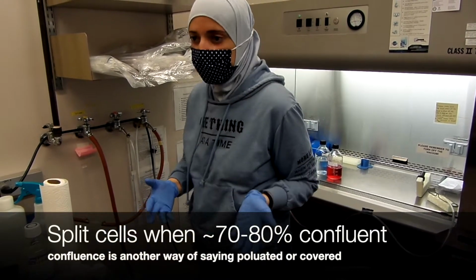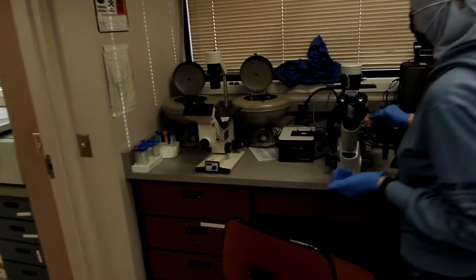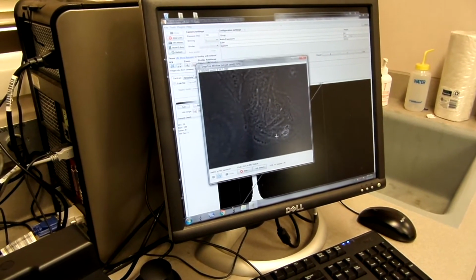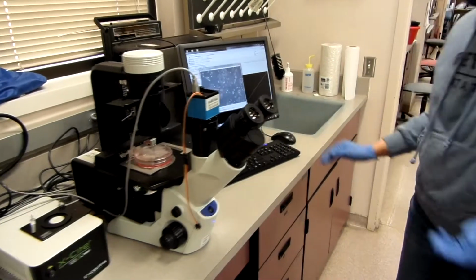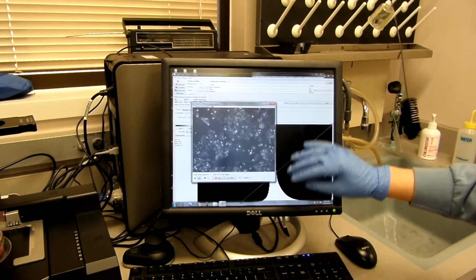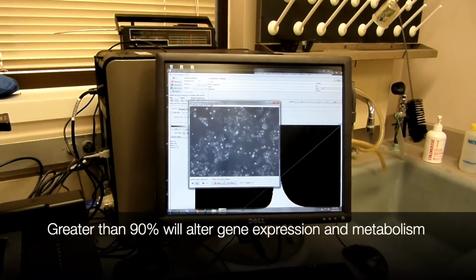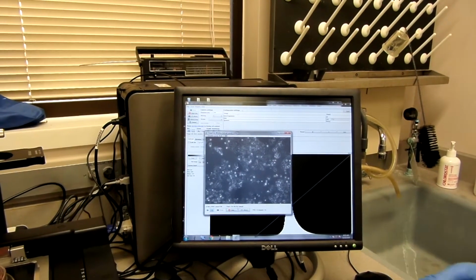I usually split cells when they are 70 to 80% confluent. So let's take a look at these cells. These are breast cancer cells. You can see they are epithelial cells. This is the 10x, let me use the 4x so that you can see the confluency. So you can see that the cells are 60 to 70% confluent, which means the cells are occupying 60 to 70% of the field. And this is very good for you to split cells. More than 90% you will start having altered gene expression, altered metabolism, and we don't prefer that because you are changing the identity of the cells you are working with.